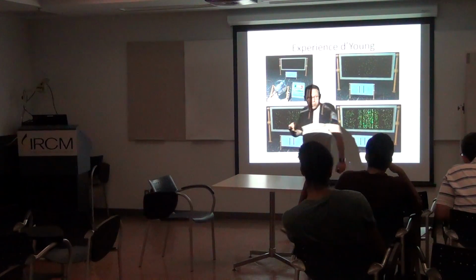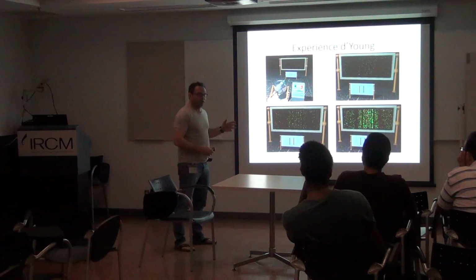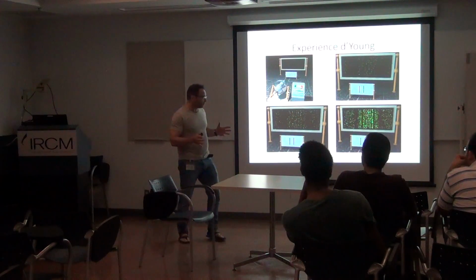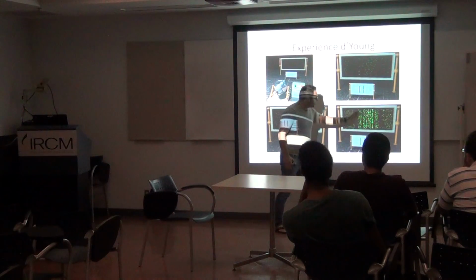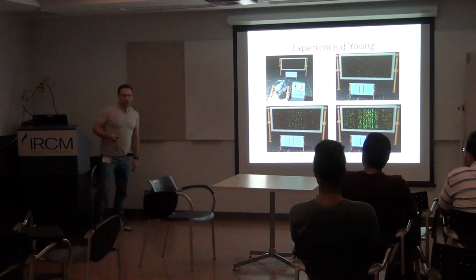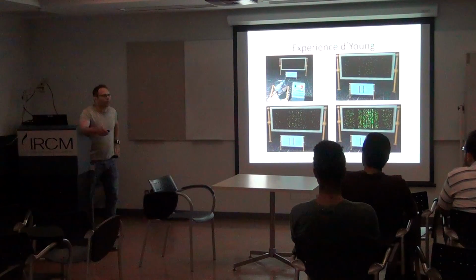That's how we can figure it out with super resolution microscopy. We take the fact that light is a wave, and we know the pattern that it should produce, so we can figure out the center with more precision. I will re-explain it with the super resolution part.